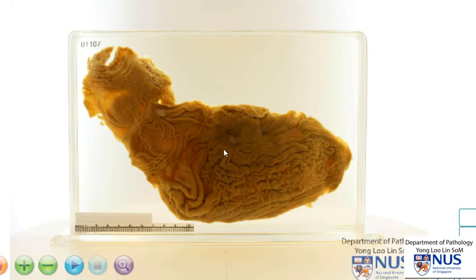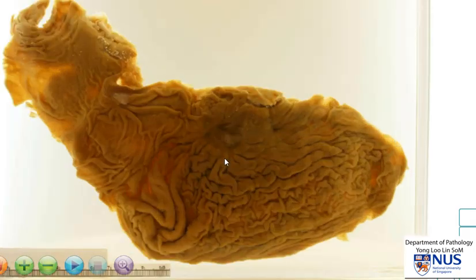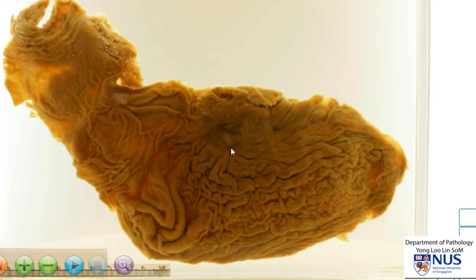In summary, we can see in the gastric mucosa that there is an ovoid, slightly irregular defect which is punched out. There is a clean base and a vessel at the base of the ulcer. The edges are relatively flat and flush with the rest of the gastric mucosa. So this is likely to be a benign peptic ulcer.